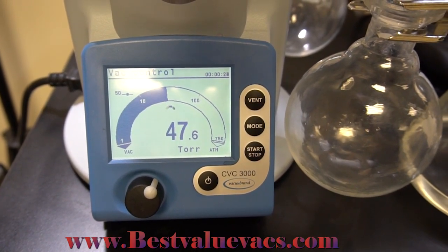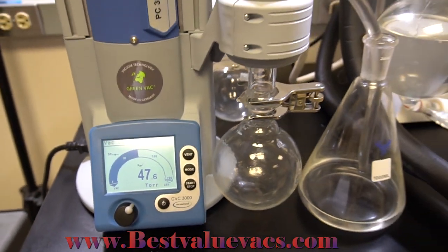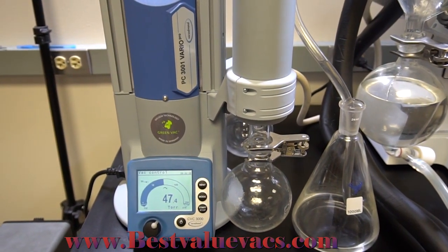These pumps are known to operate to 15,000 hours, averaging eight years of use before requiring diaphragm replacement. And all wetted surfaces of the pump are chemical resistant.